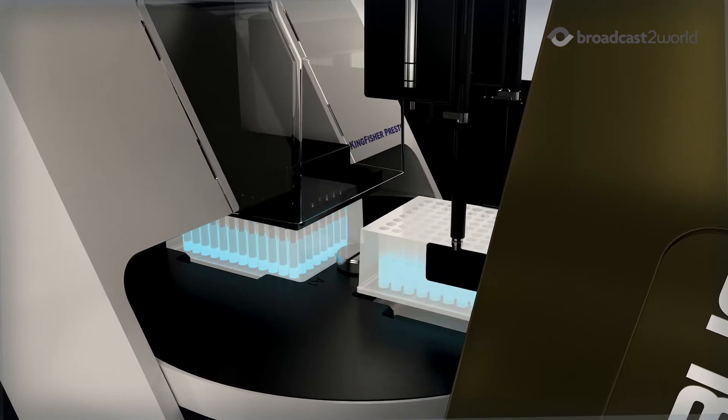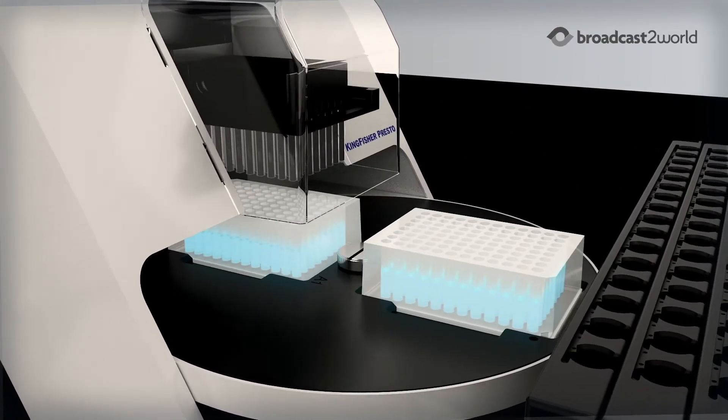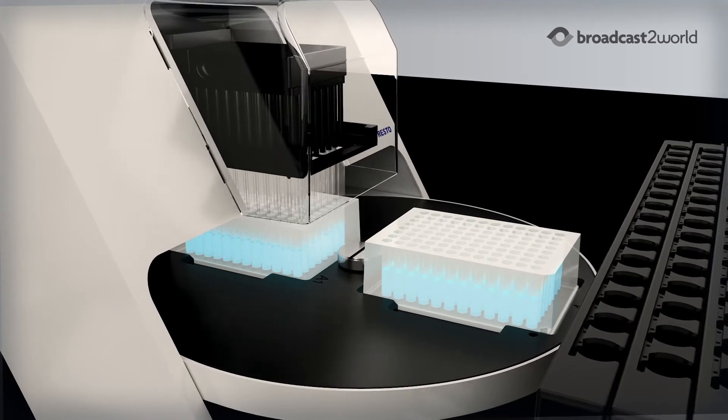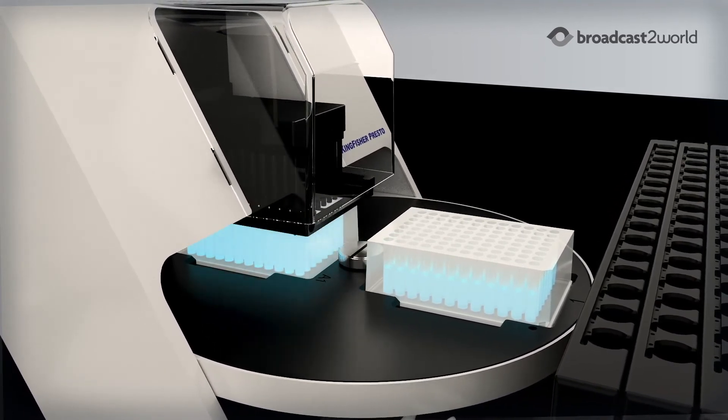The Thermo Fisher Kingfisher Presto System head then raises, and the deck spins to a new plate with a clean wash solution. The head with the DNA-bound magnetic beads is then lowered into the new plate.